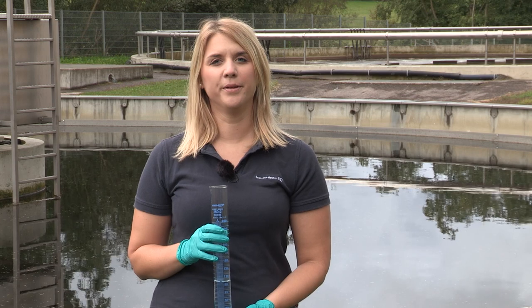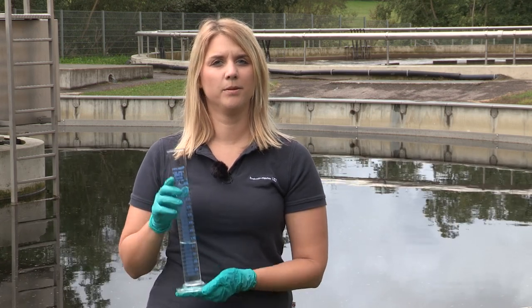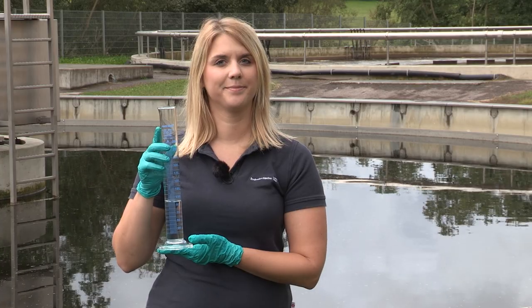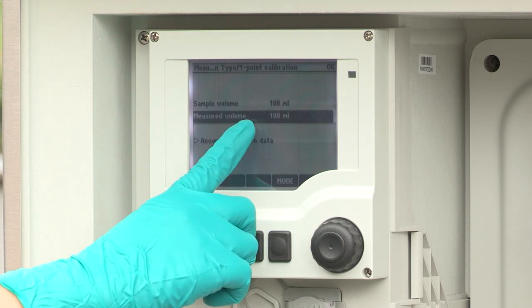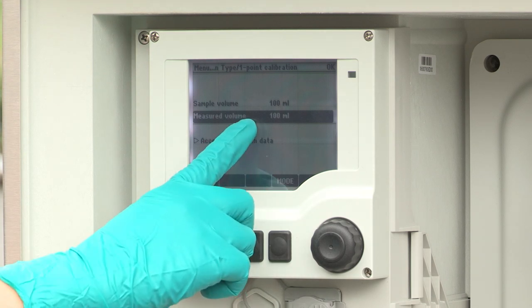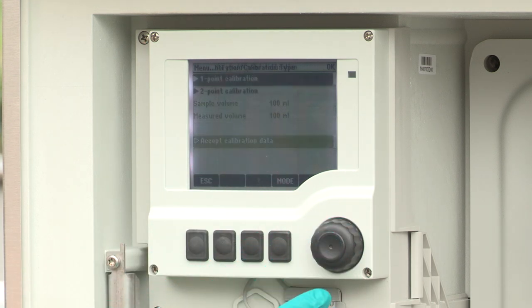Now check the volume in the measuring cylinder. The sample that was taken has a volume of 100 milliliters. If the measured volume differs from the volume that was set before, enter the actual measured volume and then select accept calibration data. If the actual measured volume is correct, just accept the calibration data.